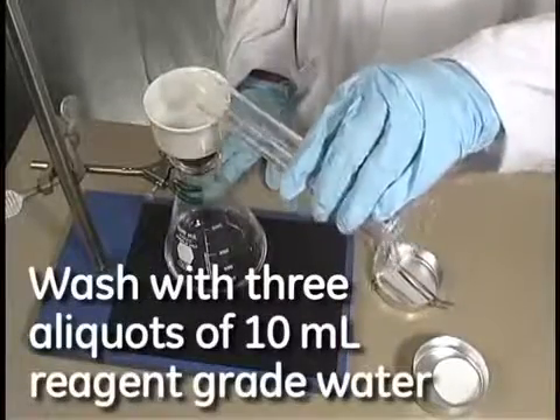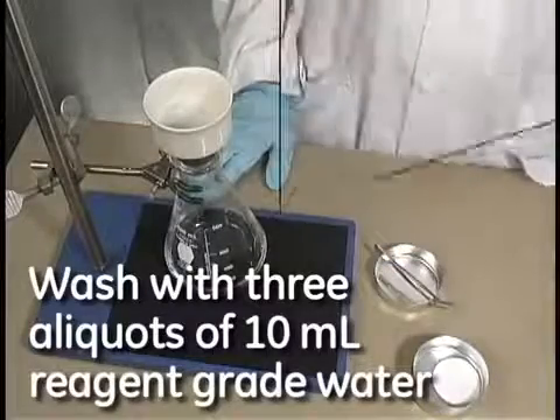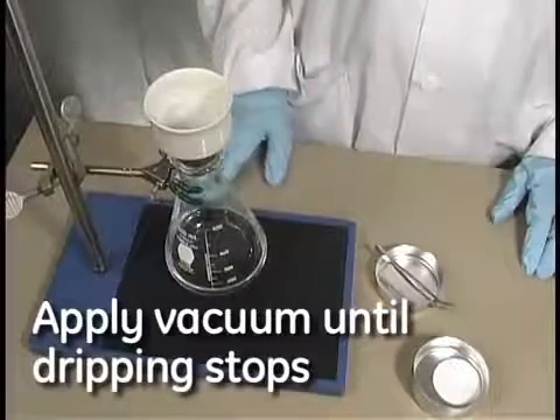After you've poured your sample, wash with three 10ml aliquots of reagent grade water. Apply vacuum until the dripping stops, then turn off the vacuum.